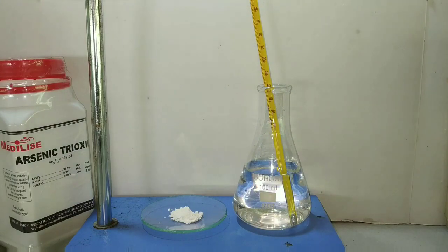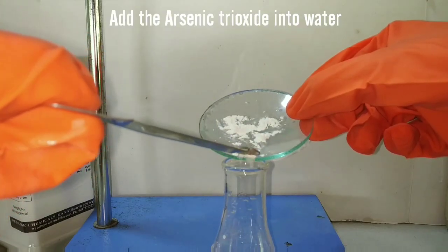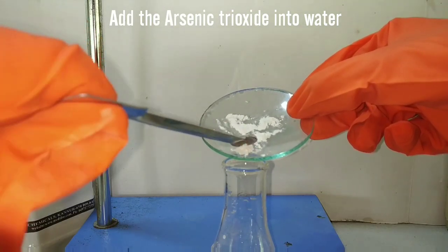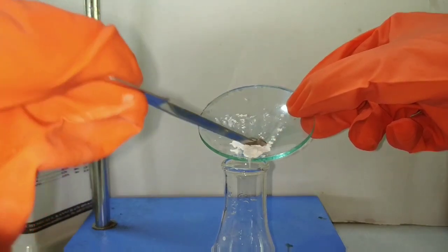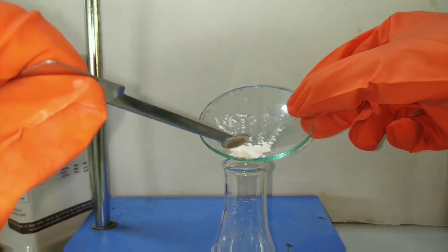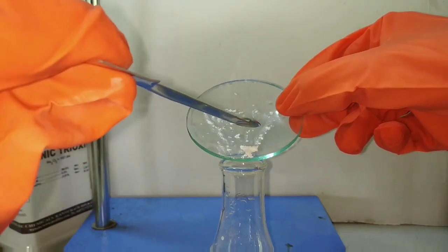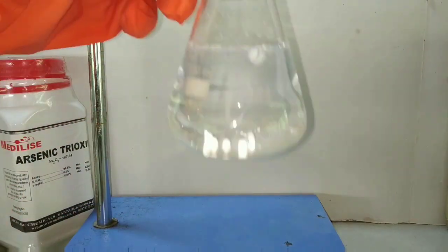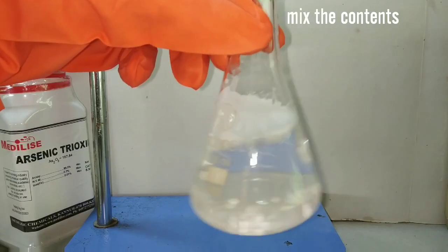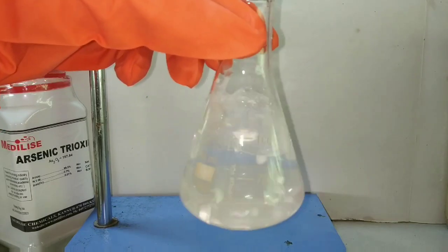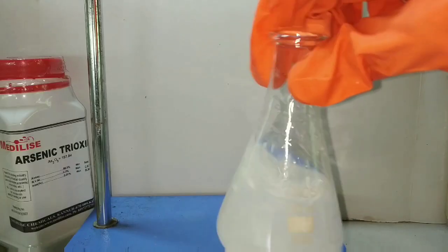I initially recorded the temperature which was around 24 degrees Celsius and now I am adding the arsenic trioxide into water. After adding the one gram of arsenic trioxide, I will mix the contents very well. You can see that even after mixing the contents, the arsenic trioxide is not dissolving in the water.